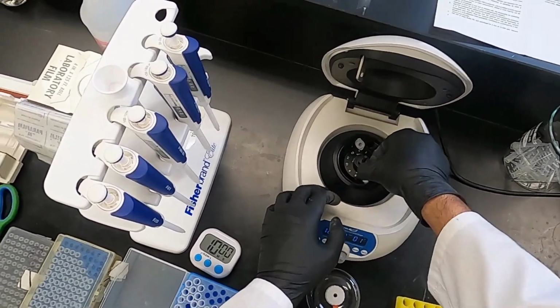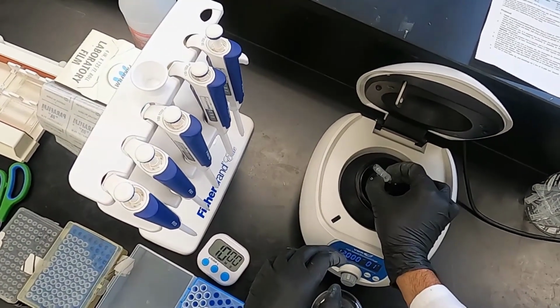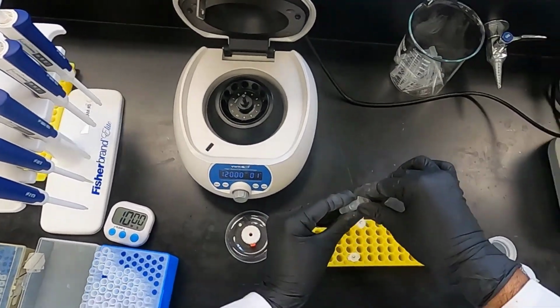One final wash step. As always, discarding our flow through, because at this stage it's not our DNA.